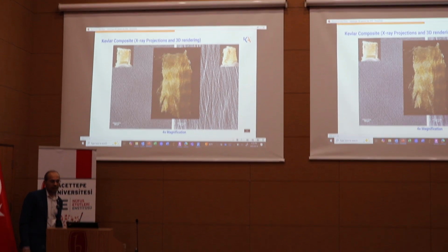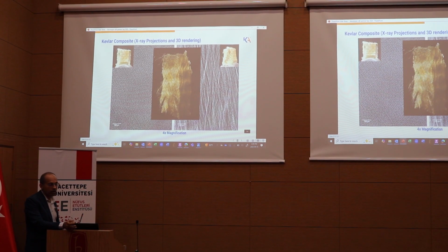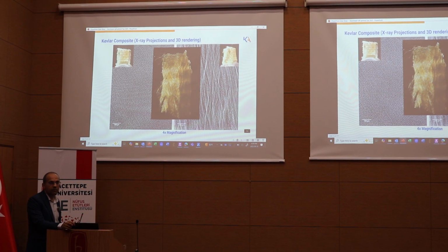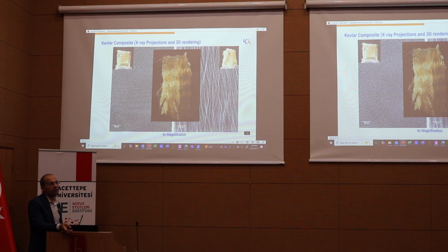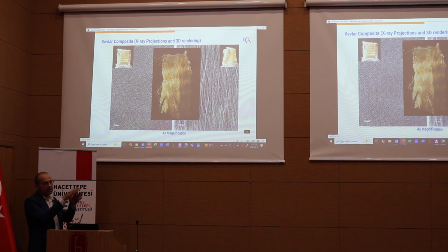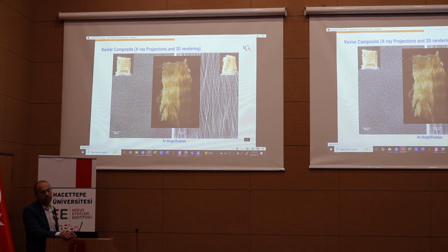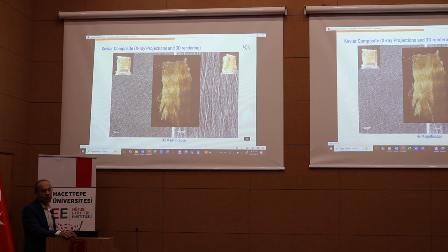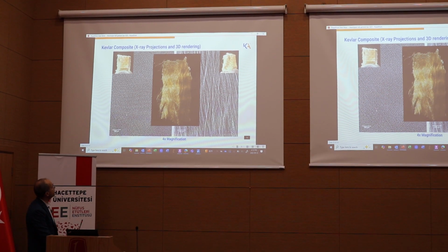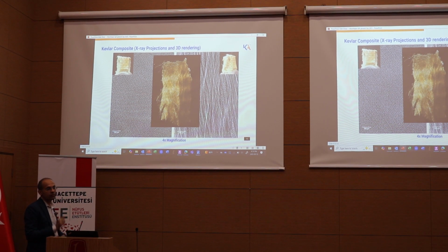This is an interesting example. This is Kevlar. Kevlar, of course, is a very low Z composite material used quite a bit in, most people hear of it in bulletproof vests, but it's actually used in aerospace for designing aerospace panels. This is an X-ray image of Kevlar. It looks like an optical image. You wouldn't believe it, but this is actually 3D reconstructed based on the micro CT. You can see each of those fibers is in the 10 micron range.